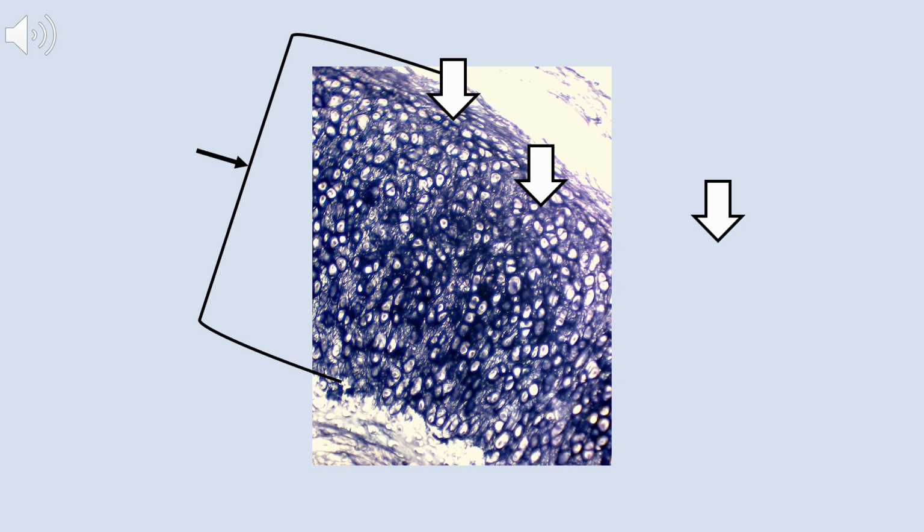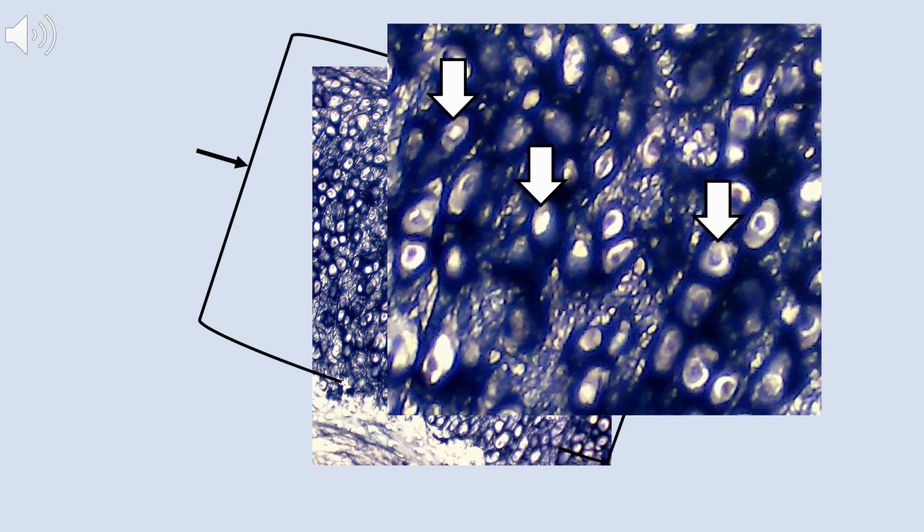This slide depicts a central mass of darkish staining tissue surrounded by two clearly connective tissue in origin bands. Right off the bat, I'm realizing I say that all the time now, sorry for that, is a perichondrium. So that's what those two layers of connective tissue on either side are, which means that the main mass in the middle is connective tissue also. And since we can see a perichondrium and those look to be a lot of lacunae that are densely packed and it stains very dark, that rules us down to a cartilage and specifically elastic cartilage.